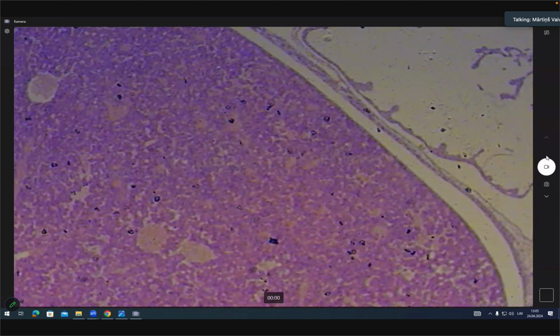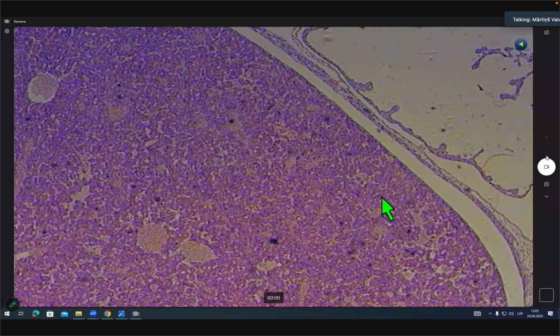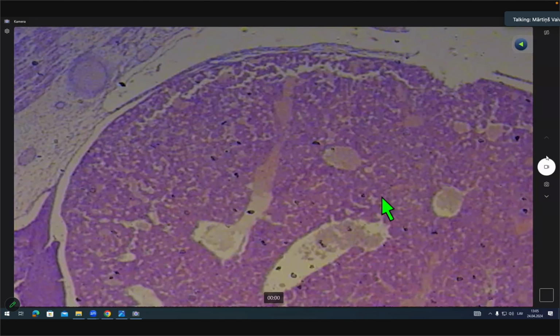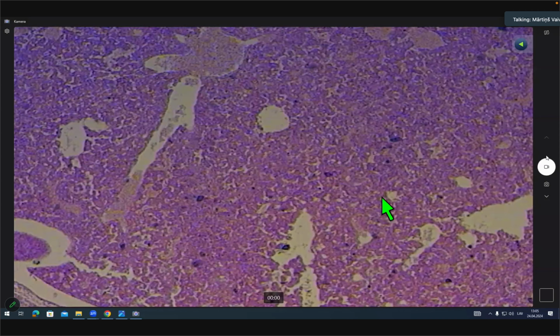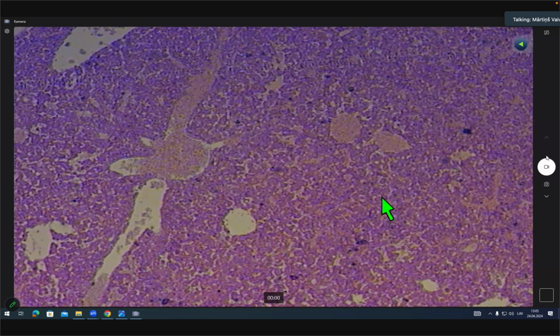This is a rat embryo cross-section showing the liver. This slide is very big, and this is the lowest magnification. The problem is, as you move through the slide, you will not be able to see everything in detail. There's a very large liver, and you might see some additional tissue. I will zoom in closely inside this slide and show you maybe another variation that's a bit better. Where are the liver sections? Oh, this is a better section. I will show you this one.